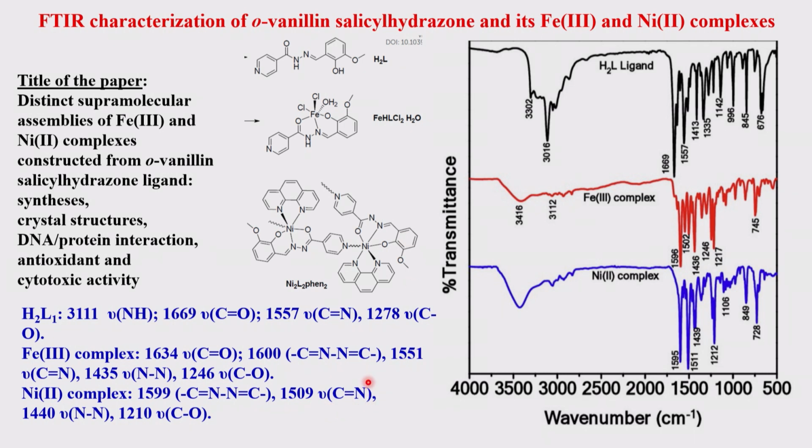By comparison of these individual vibrations, you can tell about the binding, the complexation, and that the ligand is present but bound, because of the small changes you find as expected from the bond order changing.